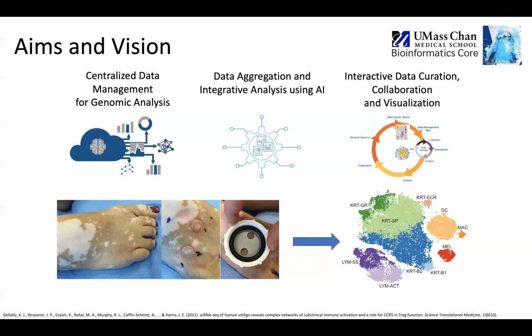And in the future, even before you send them to sequencing, by the way, you can start entering all that information before you start doing experiments. You can organize, design, and then enter that information into the system. When the files come back, you can enter them later, and then the data will be processed in Dolphin Next, and you're going to get the results and do other downstream analysis.